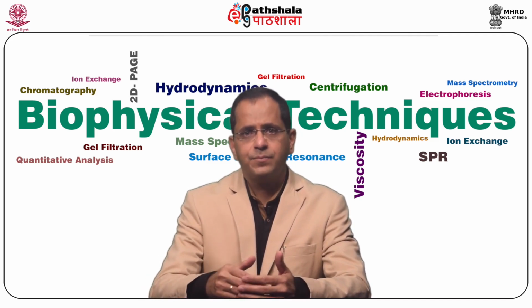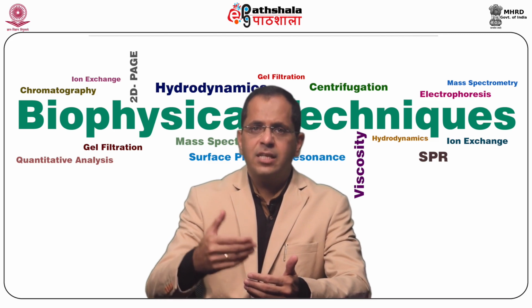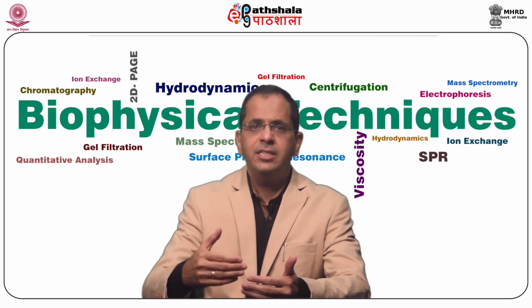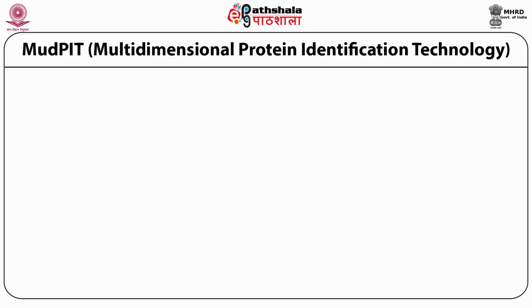Examples are plasticizers extracted from the plastic tubes, the mobile phase molecules that have been added, and the species which have not been removed from the sample matrix during sample preparation. MudPIT, or multidimensional protein identification technology.